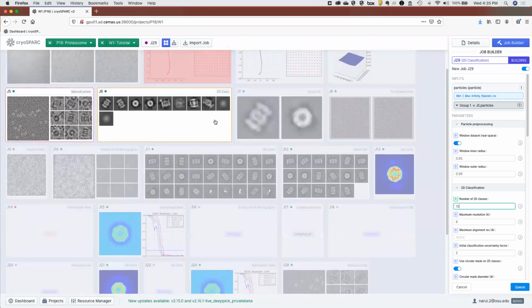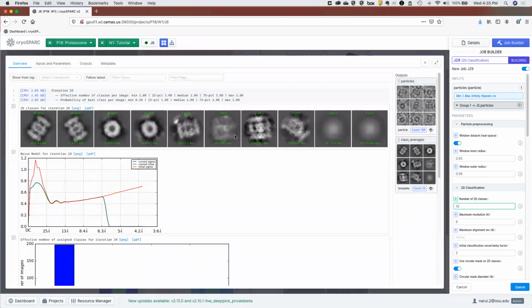And the results from this job are what you see here in this 2D class. These are the 10 classes I get, just from the 200 particles, or 198 particles, that I picked. You can clearly see there are about 4 good classes, and the rest are garbage that you don't want to pick. In the tutorial, they recommend picking just 2 of these 4 classes. So I believe I picked this first one and this second one. It's clearly a side view and a top-down view.